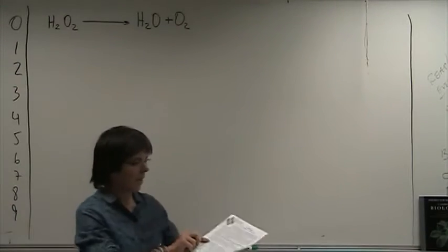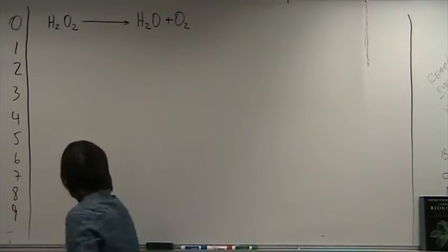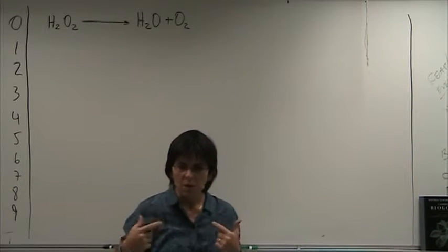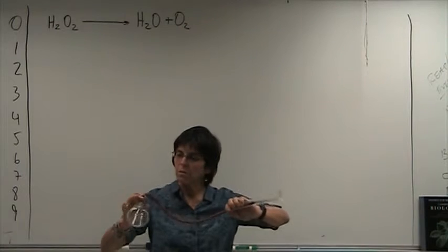Welcome to the Enzyme Lab, number 3 in AP Bio at Oakton. So what I want to do is give you a quick overview. I know some people missed the lab, and some people didn't really understand it because they were not prepared.